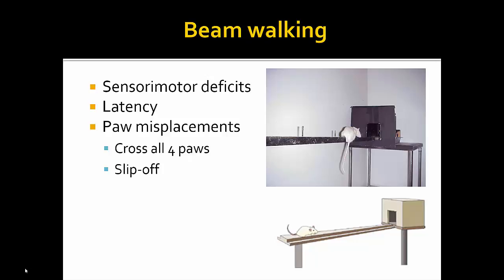So I've never done this, but my bosses are interested in getting more locomotor tasks. And in your experience, how profound does your stimulus have to be to get a deficit in this? Like TBI, you've got minutes of difference, but I wouldn't expect with our protein that we would necessarily have profound effects. Would you recommend it? Yeah, you'll see Rotarod or total activity locomotor differences. But you might not want to do directly the straight beam walk.